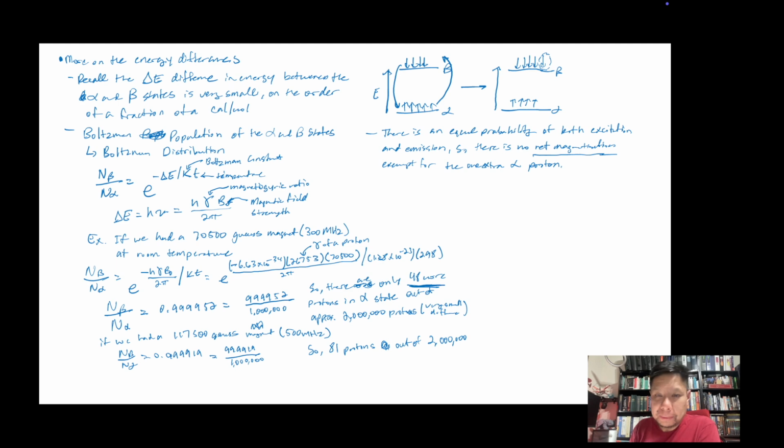Because again, the protons are absorbing the radio waves, right, which is electromagnetic radiation, the weakest of them all. And after the magnet has already made this alpha beta population state occur, the one extra one will either be excited or relaxed, right? And if it's going to get excited, it gets excited because it absorbs the RF radiation, radio frequency radiation, from the RF pulse that came from the RF coil, right? And so sometimes people refer to this net magnetization as an absorbance, right?